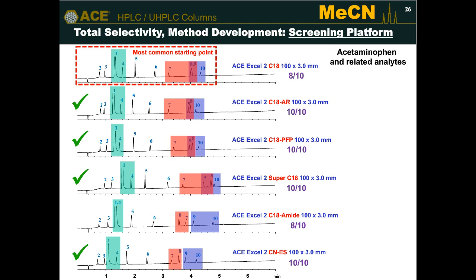However, the point from what I'm trying to show here with this example is at least if you run your analytes with different chemistries and solvents, you're using chromatography theory to try and help you get the best start in your method development activity. Hopefully you'll have an option from your chemistry and solvent combination, but if not, there should be a better starting place than if you just simply started to do some injections and tried to do your method development from there.